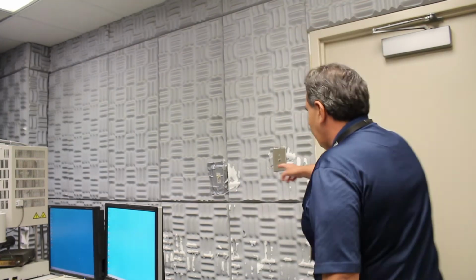When you first enter the room, turn off the HEPA filters. Okay, on the switch.